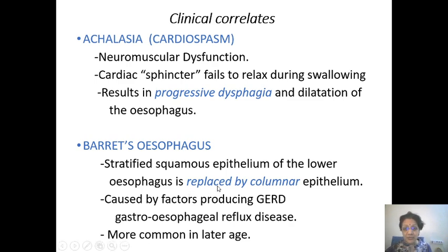The next thing we will do next week is the lining of the stomach, and that has a columnar epithelium. In fact, the majority of the gut is columnar epithelium. Esophagus and anus are the exceptions to the rule. So this columnar epithelium of the stomach seems to have crept up into the lower 1/3 of the esophagus. That means what should have been stratified squamous has not been laid down in layers, but has been laid down in a single layer as a columnar.